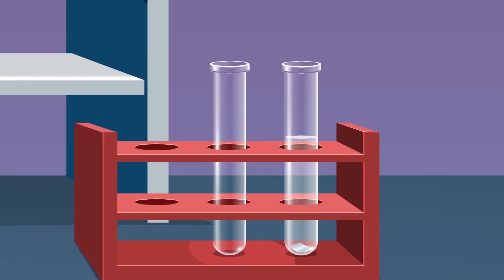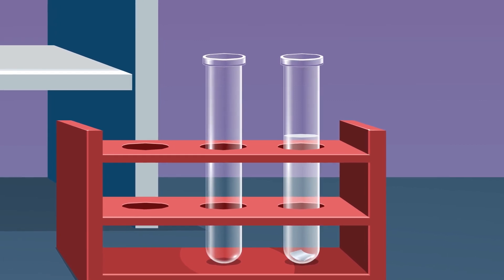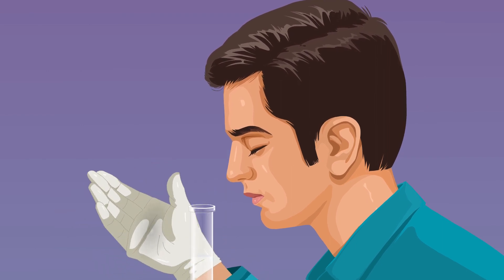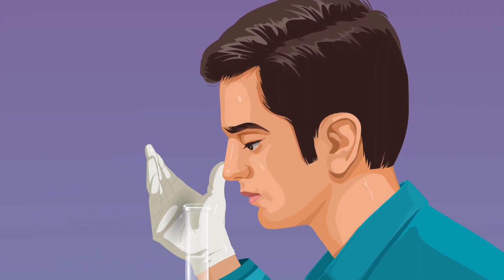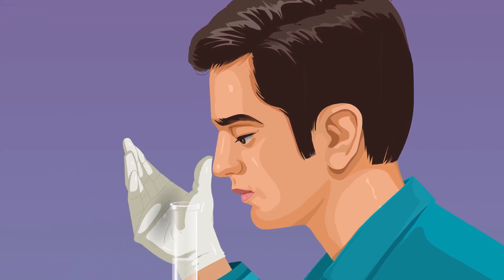Observe the effervescence and colourless gas coming out through the test tube mouth from the reaction mixture. Perform the smell test on the gas liberated by fanning the gas gently towards your nose — there will be no smell for the liberated gas.